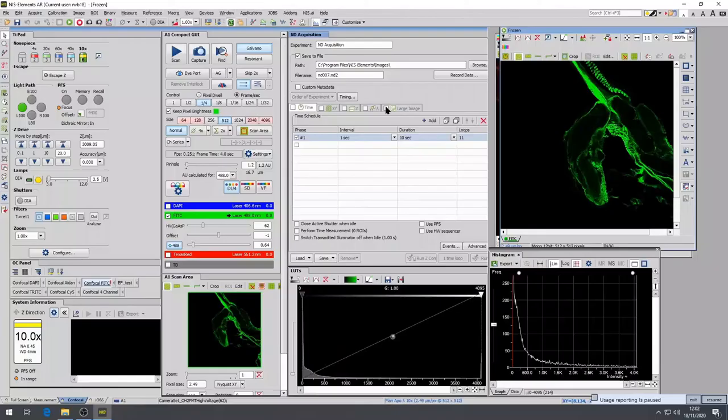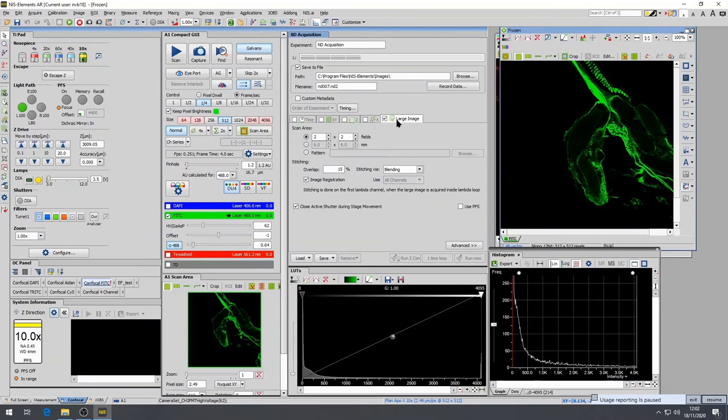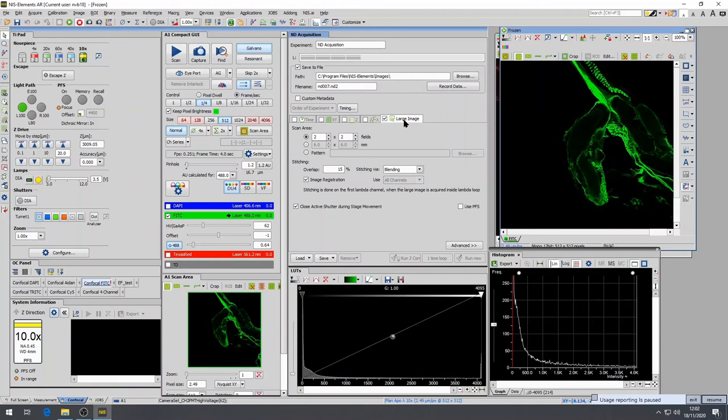Large image is a function that allows you to take a number of adjacent fields of view and display them next to each other or stitch them together. This is useful when you want to have a high resolution image but using a high power objective and still want to cover a wider field of view. To do this, the current field of view should be in the middle of the mosaic you want to make. Select the scan area and the number of columns and rows, for example, the number of images across and down.